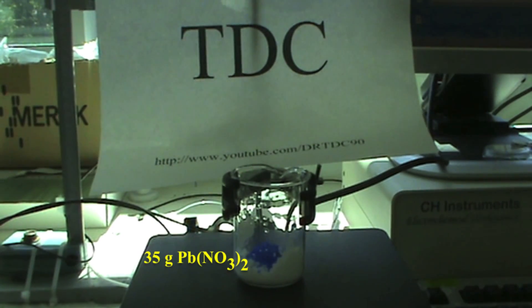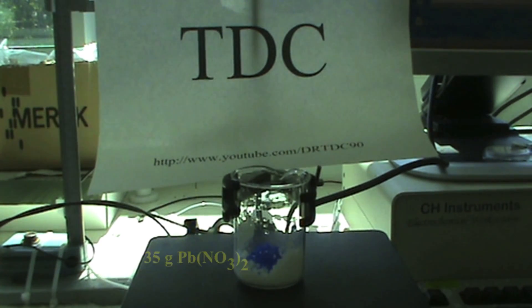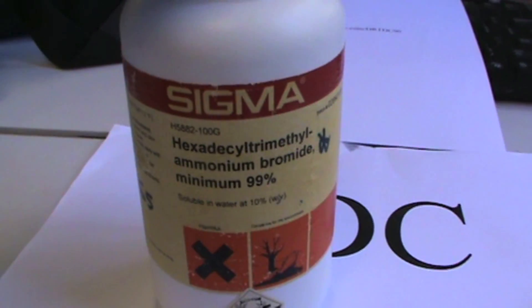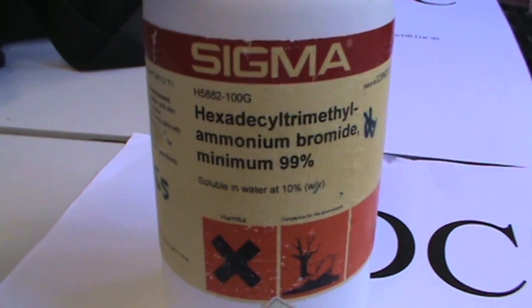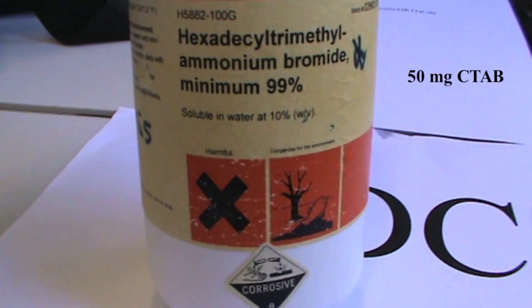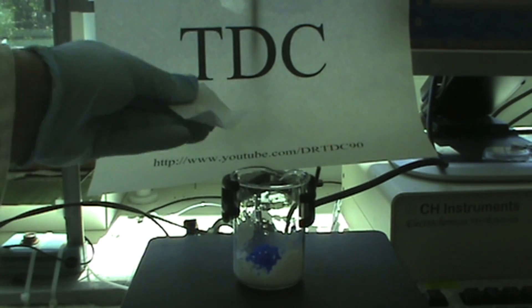To start, measure out 35 grams of lead nitrate and 2.5 grams of copper nitrate. Next, we will be adding the surfactant. Measure out 50 milligrams of CTAB and add the chemicals together into a 100ml beaker.